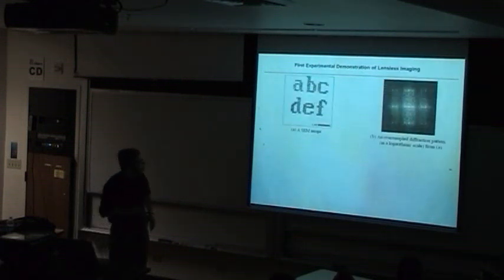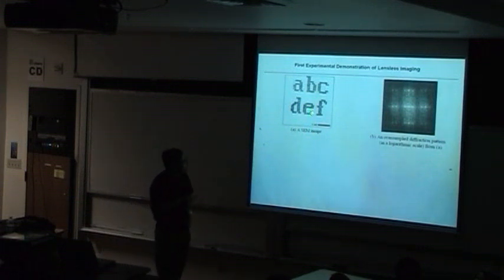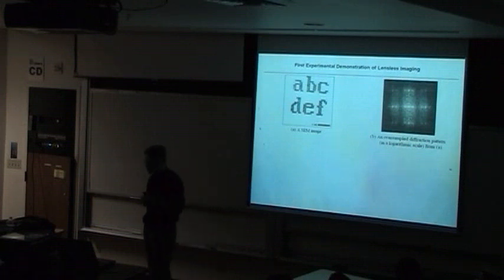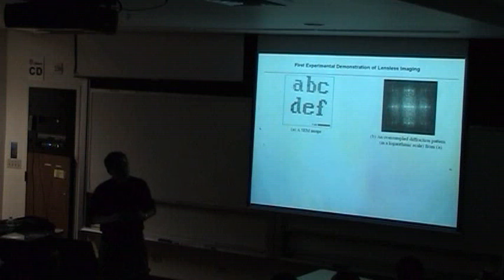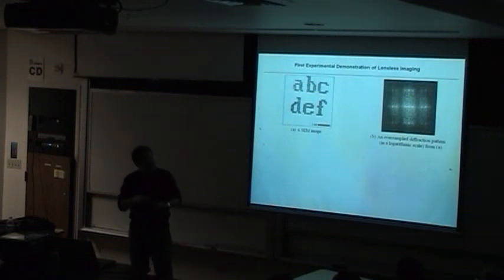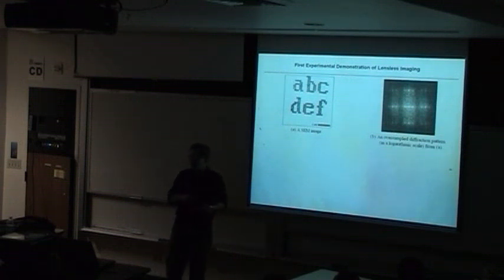And here shows kind of experiment demonstration: the SEM image of the test sample, and this actually uses soft X-rays, the X-ray diffraction pattern. Now, one thing I found, because many of you are students, I just want to share my personal view. If you want to try some challenging experiment, it's always tough at the beginning. When I tried this experiment, this project was not funded, and people just didn't think this would go anywhere.